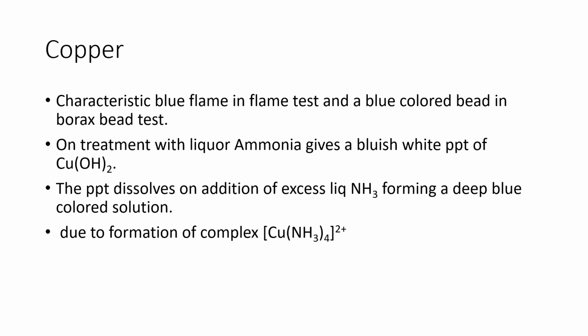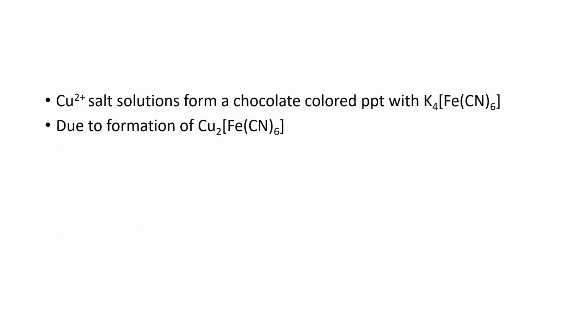Understand here, the bluish white precipitate of copper hydroxide is dissolving due to the formation of a soluble complex, that is the tetraammine complex of copper. Copper salt solutions also form a chocolate colored precipitate with K4[Fe(CN)6], that is due to the formation of the copper hexacyanoferrate complex.